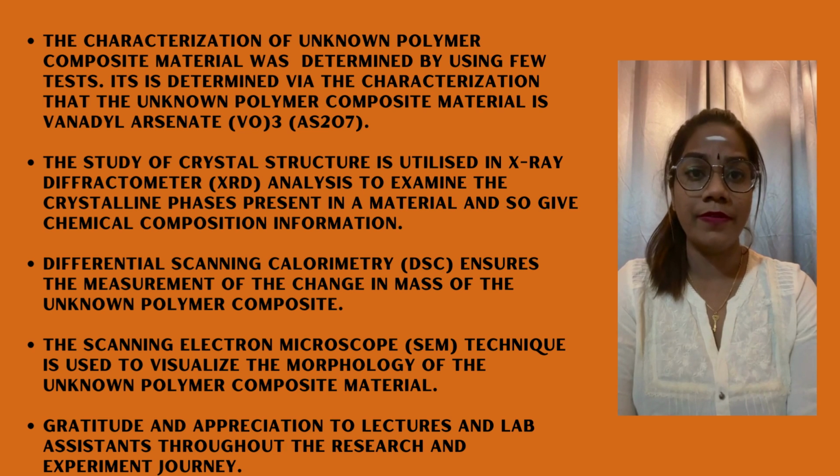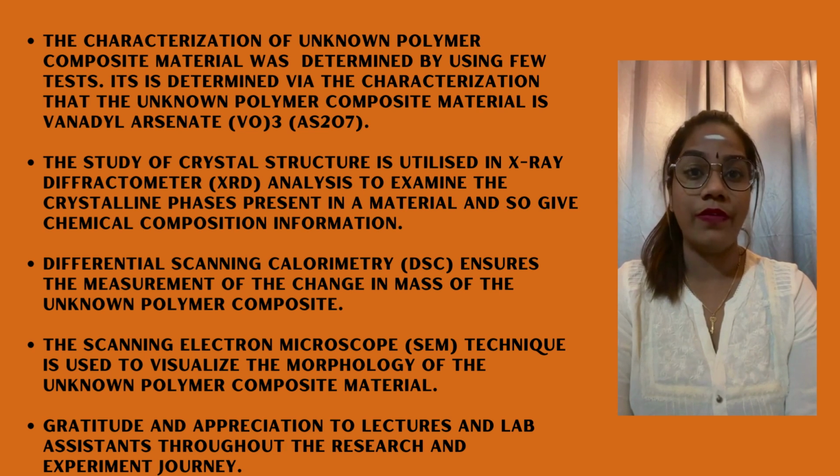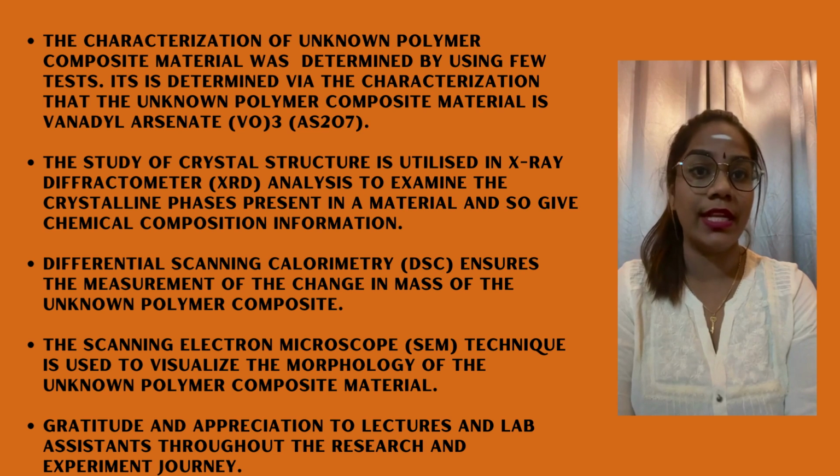The XRD pattern of the unknown polymer composite material for the bulk vanadyl arsenate showed sharp and intense peaks, indicating that the samples were crystalline. DSC ensures the measurement of the change in mass of the unknown polymer composite. The melting and crystallization behavior of the polymer composite is tested using the DSC equipment. The second heating scan is used for the melting analysis, while the cooling scan is used for the crystallization analysis.